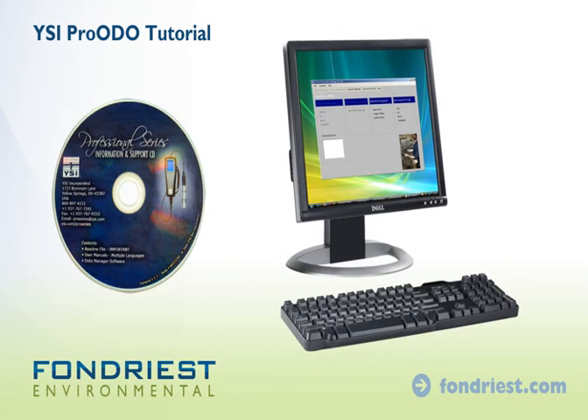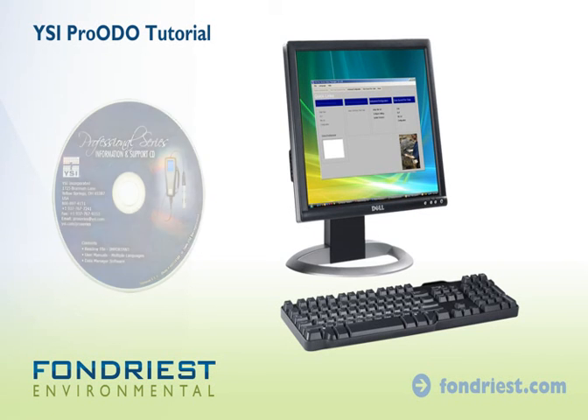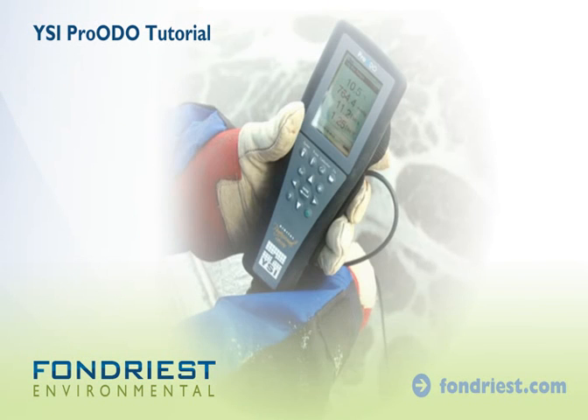With the included software, data is quickly processed. The YSI Pro-ODO simplifies fieldwork while ensuring the most accurate dissolved oxygen measurements possible. Contact a Fondriest applications engineer for more information.